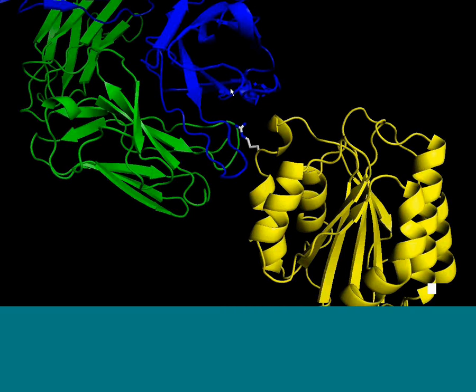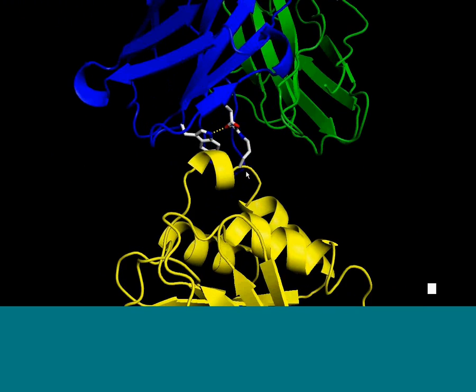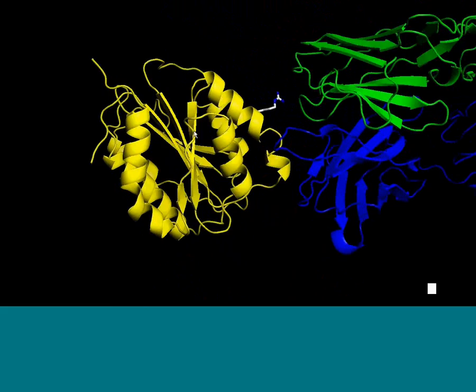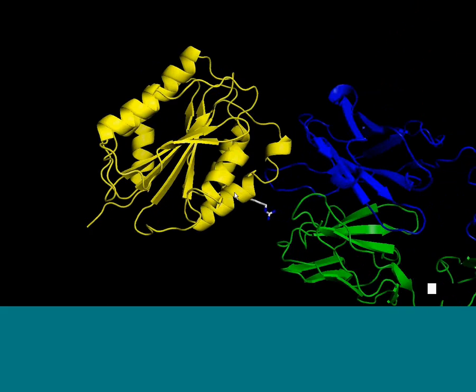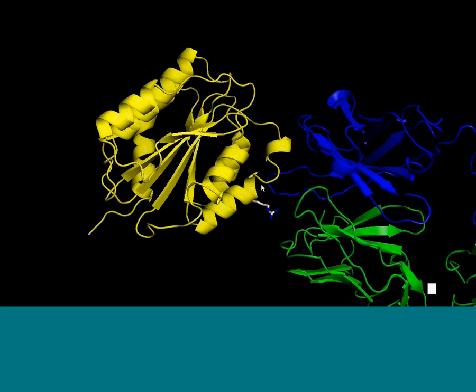So without this molecule here, it's basically an arginine that's sticking out directly into the solvent. And if we then take a look at the second arginine, it's also very much projecting straight into solution from this helix, and it's not making any contacts with other residues in the molecule. So that's an excellent point, and one that we were concerned about, that the mutation could destabilize the molecule.